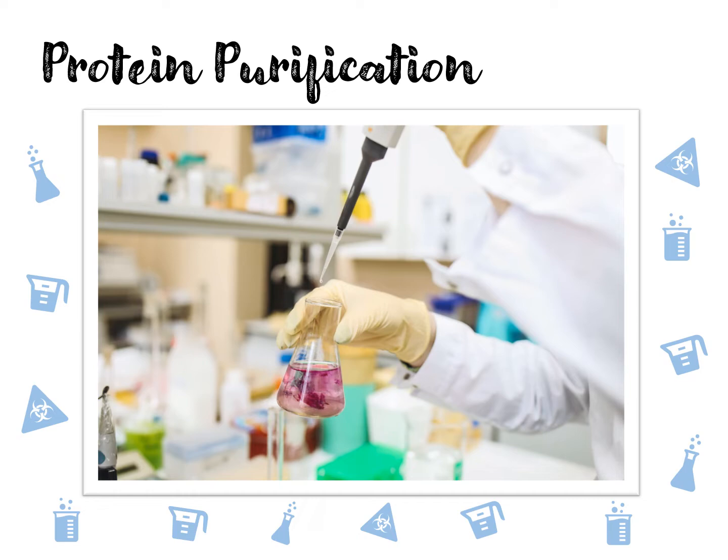I've already uploaded the first lecture in this series, which was about the different techniques of cell lysis, what the advantages and disadvantages of each of these are, when to select which, and the basic principle of each of these methods. So in this lecture, we are going to talk about the next step, that is what to do now that you have lysed your cells.